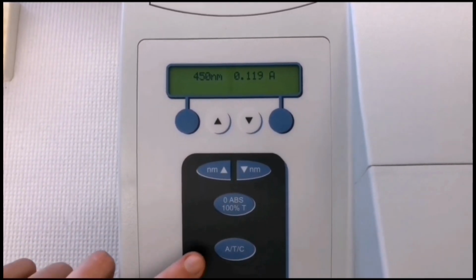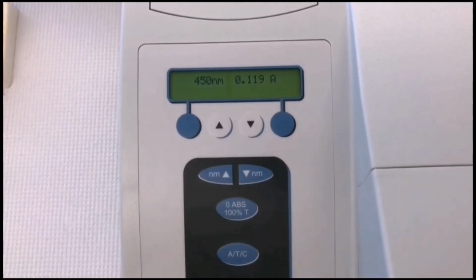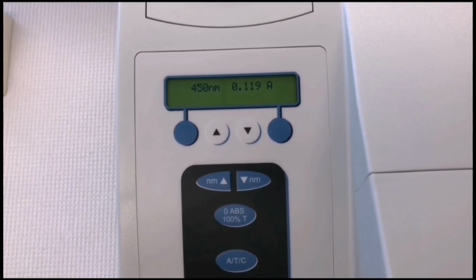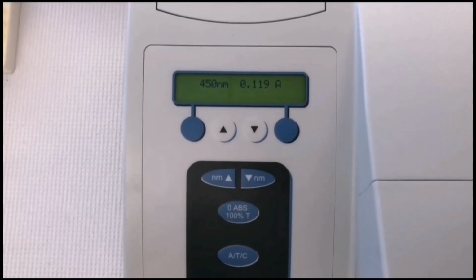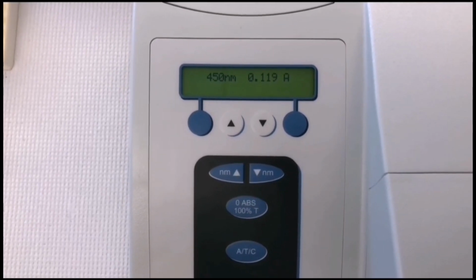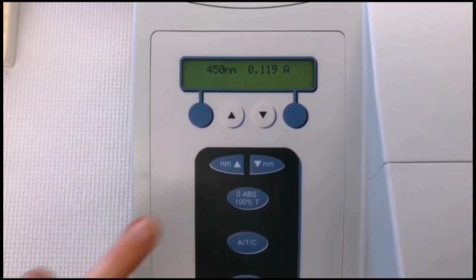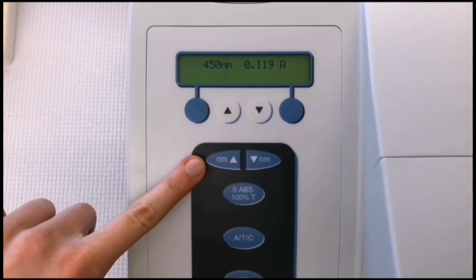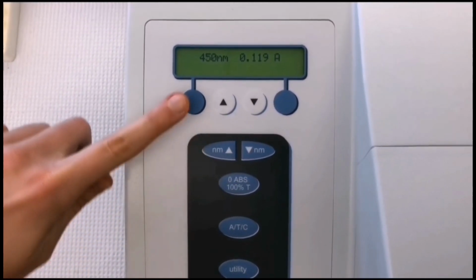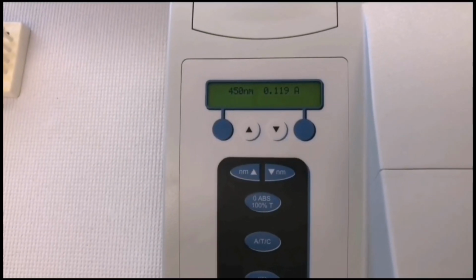And after that, adjust the filter wheel. Set the filter wheel to the corresponding filter for your chosen wavelength. For example, use the violet filter for wavelengths between 300 and 375 nanometers, blue for wavelengths 375 to 520 nanometers, yellow for wavelengths between 520 and 740 nanometers, and red for wavelengths 740 to more than 900 nanometers. Next, set the mode. Select the mode that displays percent transmittance or percent absorbance depending on your experiment requirements.